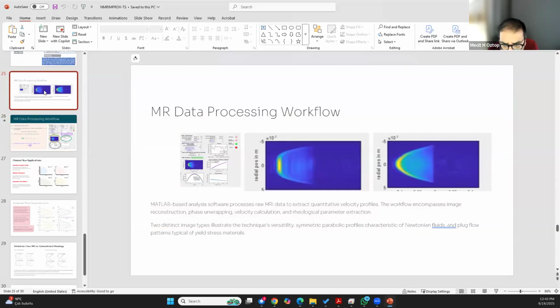Well, I haven't thought about it. We are taking the signal average, and I think it should be denoting the maximum velocity, a certain velocity range. That is what I believe.